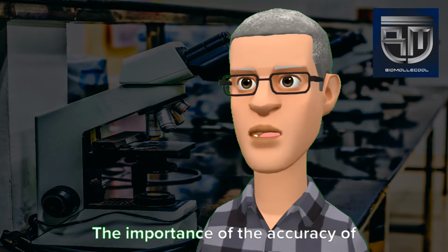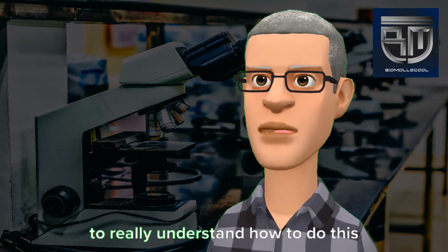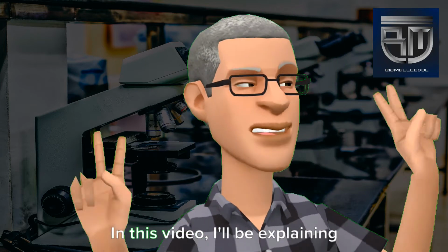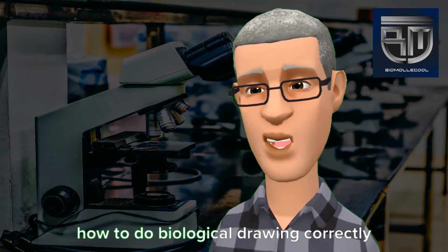The importance of the accuracy of our biological drawing engenders us to really understand how to do this. In this video, I'll be explaining how to do biological drawing correctly.